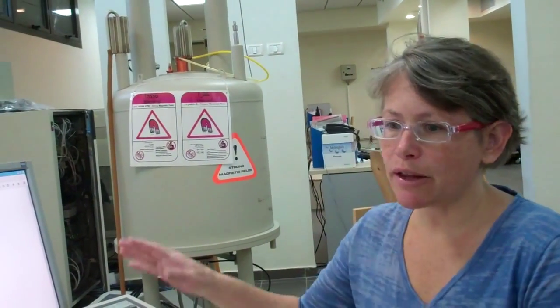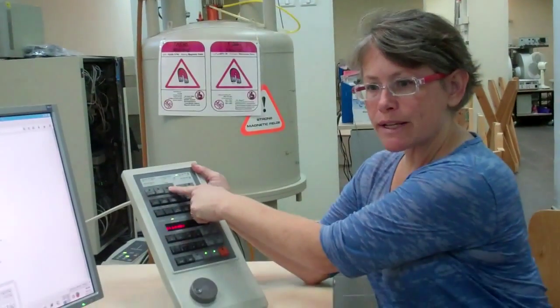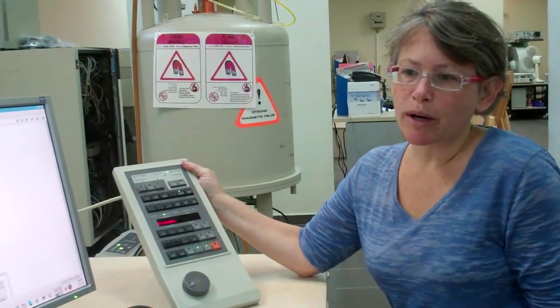We now go to step number 4 of the instructions, which is optional. There's another button here, labeled spin on-off. To spin the sample, I press the button and the green light will turn on.